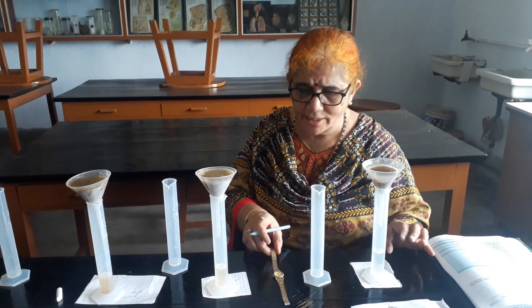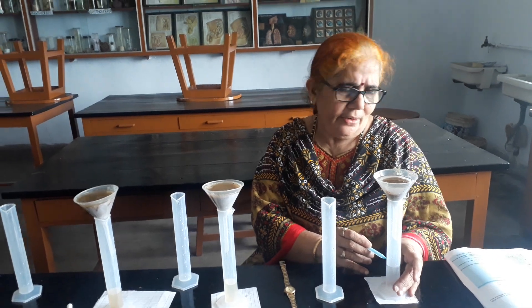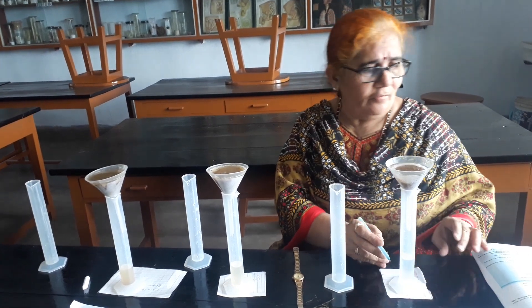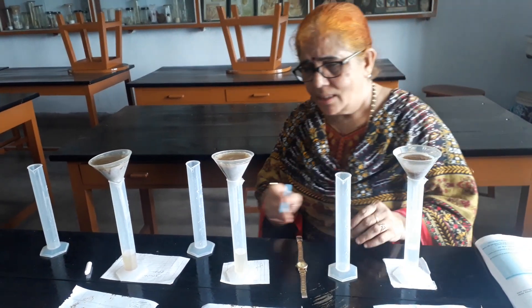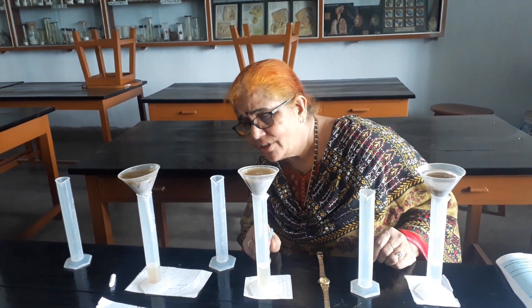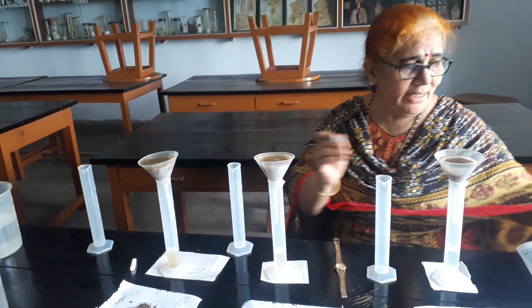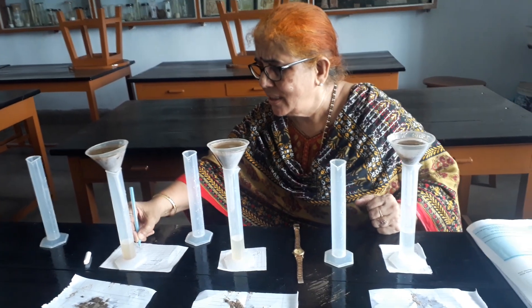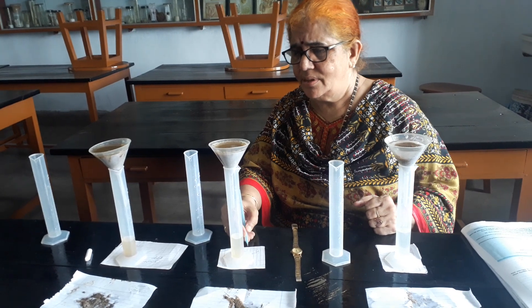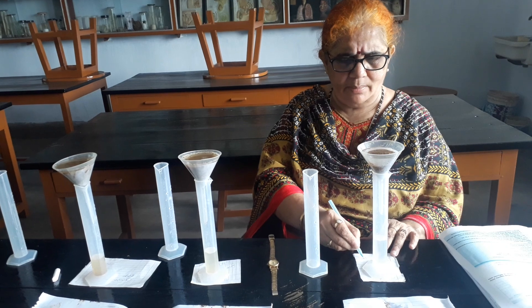Now 5 minutes is over. You can see in the sand already 22 ml of water has collected. Here in silt you can see 14 to 15 ml, roughly 13 to 14 ml. So the first reading: clay shows 15 ml, silt shows 18 ml, and sand shows 22 ml. Sand is falling very fast.